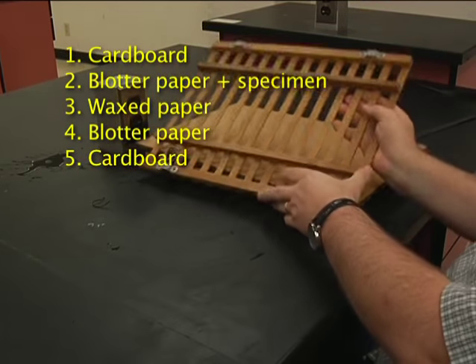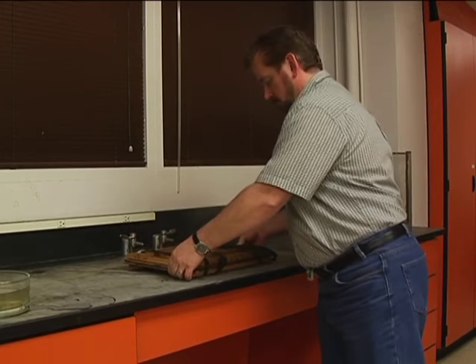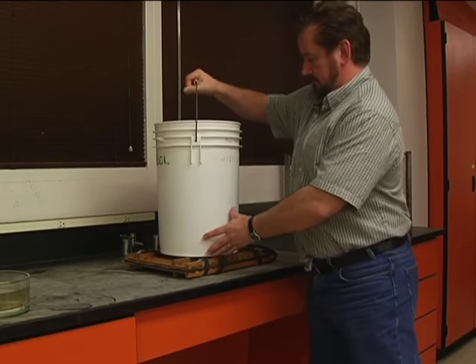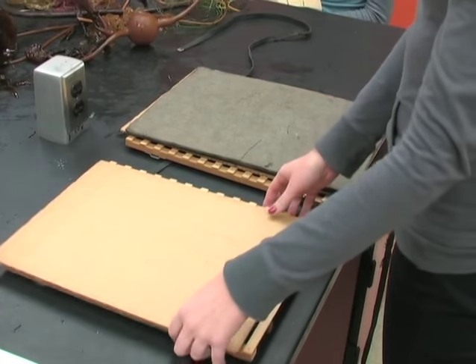You may repeat these steps for more specimens — just continue stacking the press in the same order. Weigh down the press evenly with a heavy object such as a bucket of sand or sea water. Check the press daily and replace any damp blotter papers with clean dry paper.